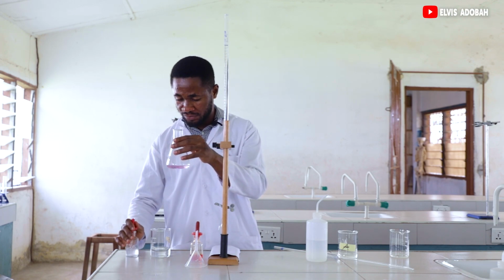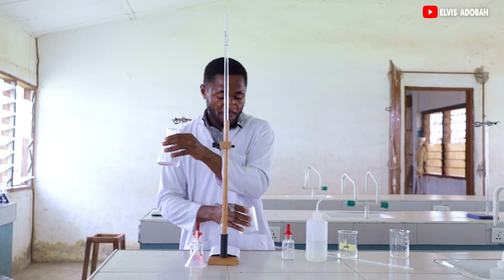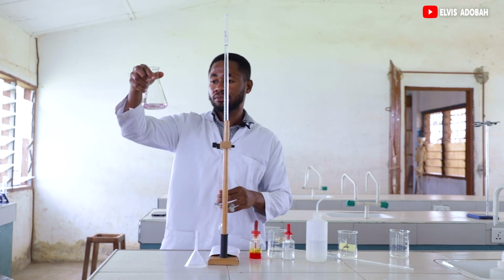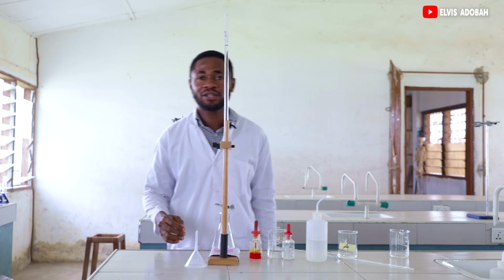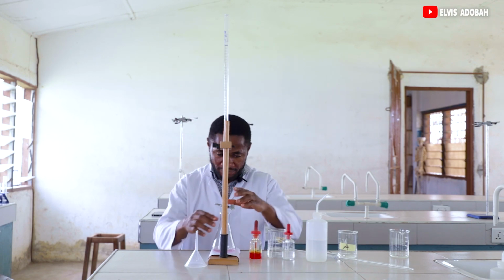I'm using 3 drops. Then we have our purple color. I'll be adding the acid until we get to the appearance of a colorless solution over here.